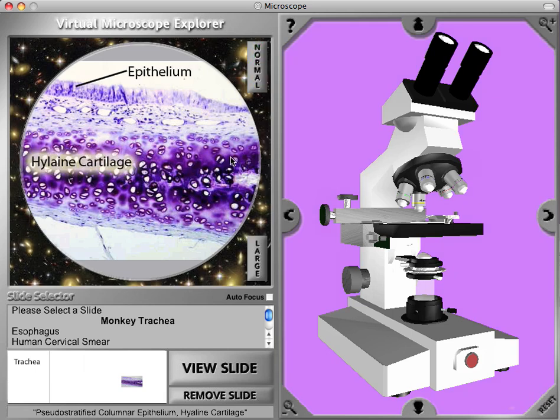Here we can see the epithelial layer and the hyaline cartilage very well. This is a very low magnification, and we can't see much cellular detail.